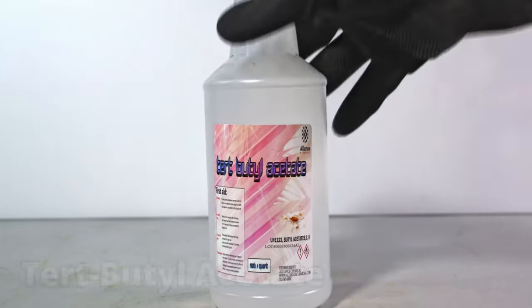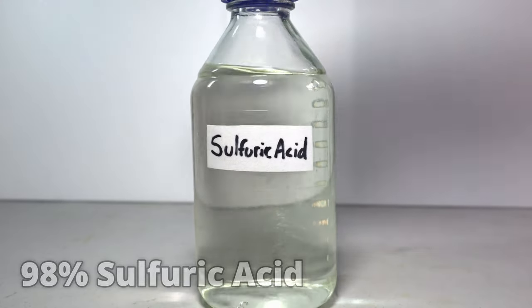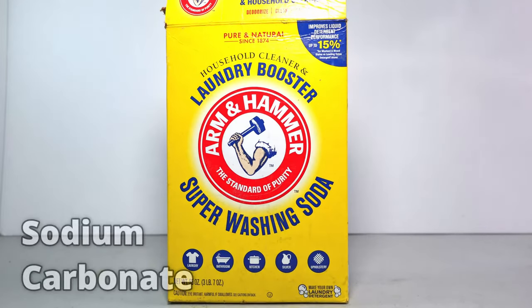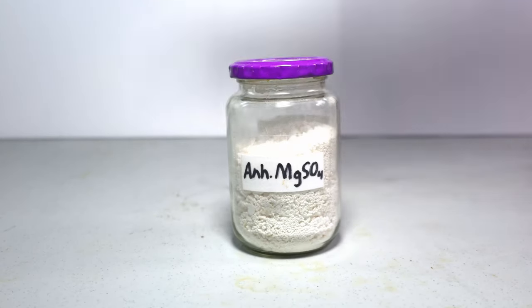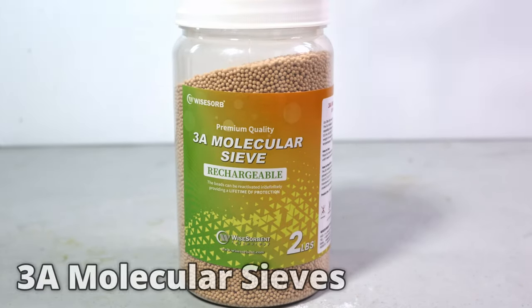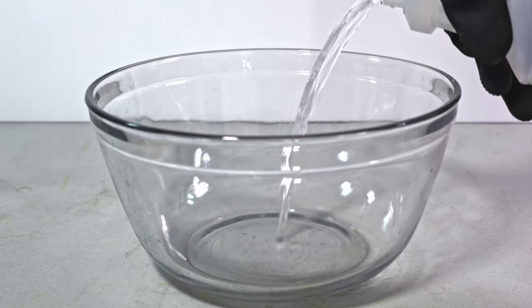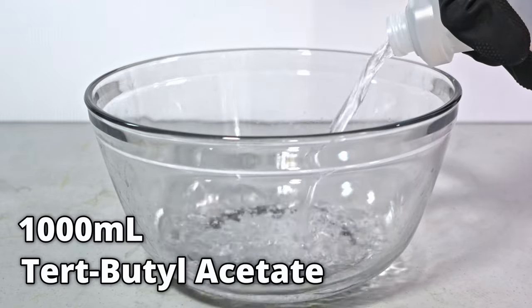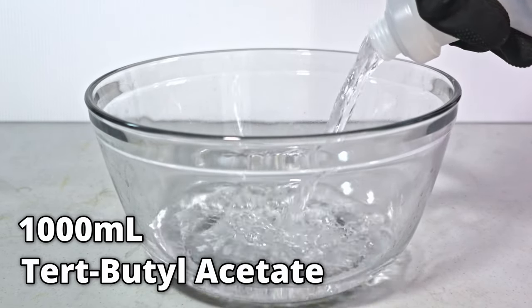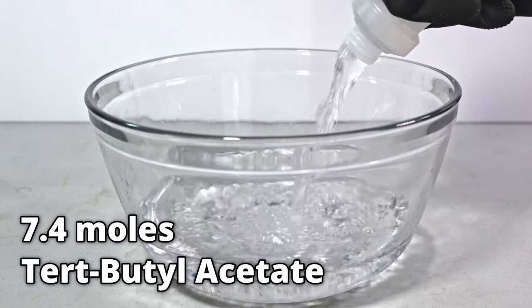The materials you need are tert-butyl acetate, sulfuric acid, sodium carbonate, anhydrous magnesium sulfate, and molecular sieves. The first thing I'm going to do is dump in a whole liter of tert-butyl acetate. This is roughly 7.4 moles of tert-butyl acetate.